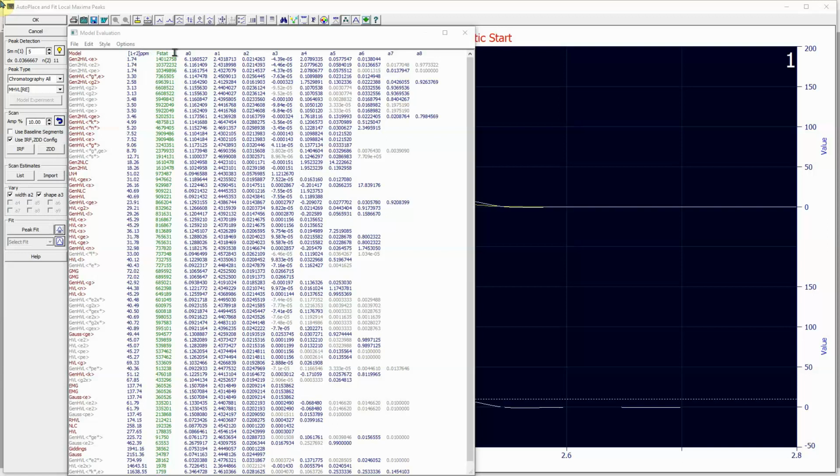The F statistic is probably the most widely used information criterion for determining the model that most effectively describes a given set of data. Unlike the ppm criterion, each additional parameter must make a significant contribution in order for the F statistic to increase. Here we see something interesting. The best models for F statistic are twice generalized models, meaning that both third moment and fourth moment adjustable parameters are significant. This fourth moment term in a twice generalized model is typically needed only when directly fitting gradient peaks where the gradient has introduced a compression in the peak shape.